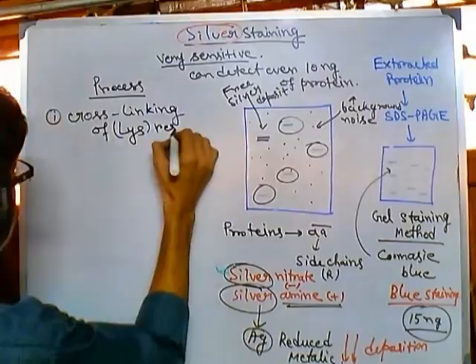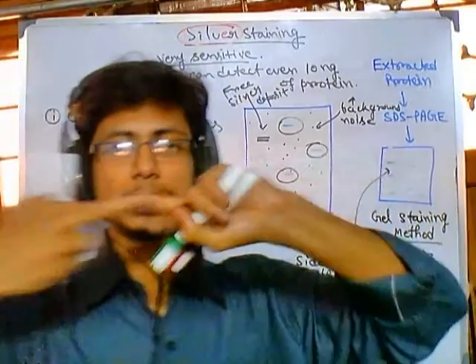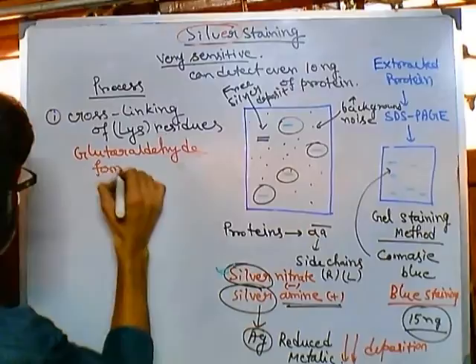because I wrote here that silver nitrate acts with the side chain, but usually it acts with the lysine side chain in most cases. So what we need to do is cross-link all the positively charged side chains of lysine. So cross-linking is done using a cross-linking agent. And for this cross-linking we take glutaraldehyde or formaldehyde. Okay, these are the cross-linking agents we utilize.